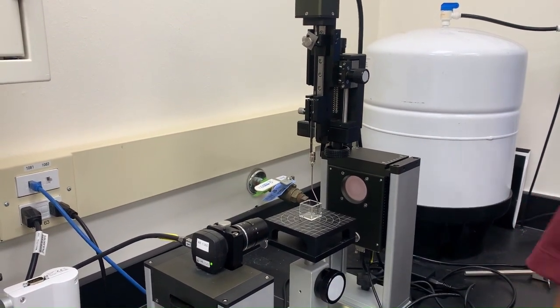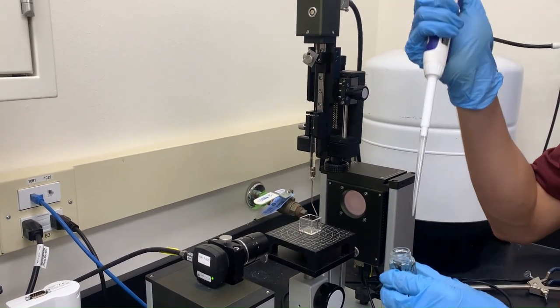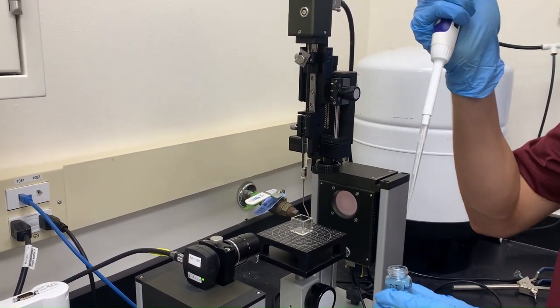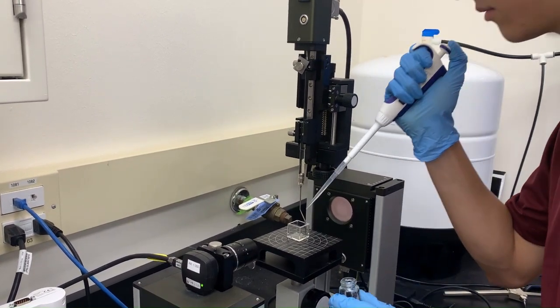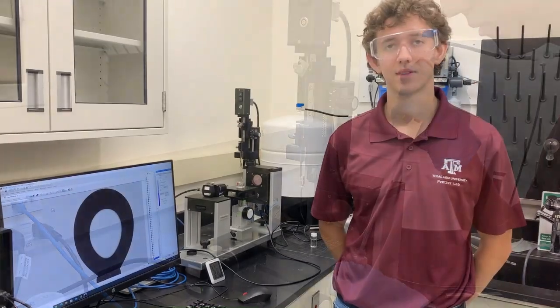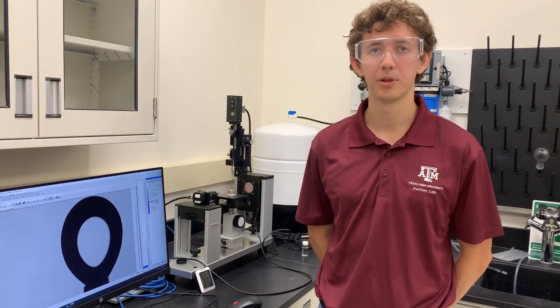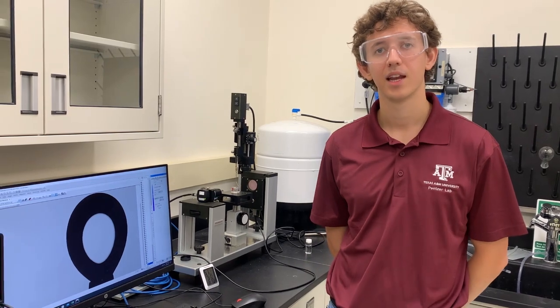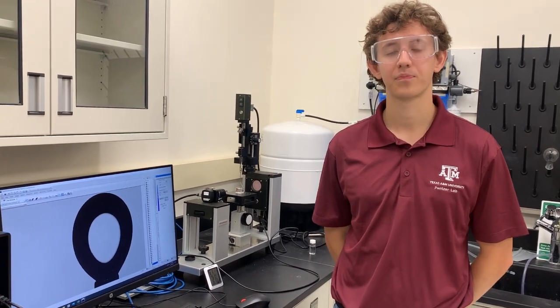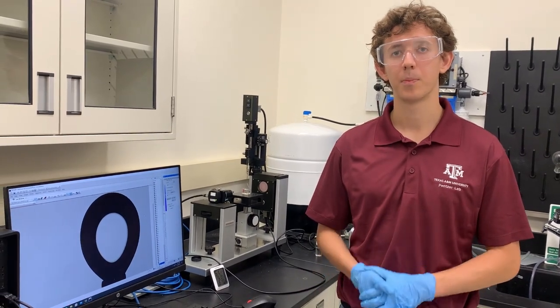Great. Now, fill the glass cell with your continuous phase. In our case, we're filling it with deionized water. After bringing your needle tip into focus on the screen, dispense a droplet of toluene or any given droplet phase and remove any air bubbles. The droplet phase should fill about a third of the screen.